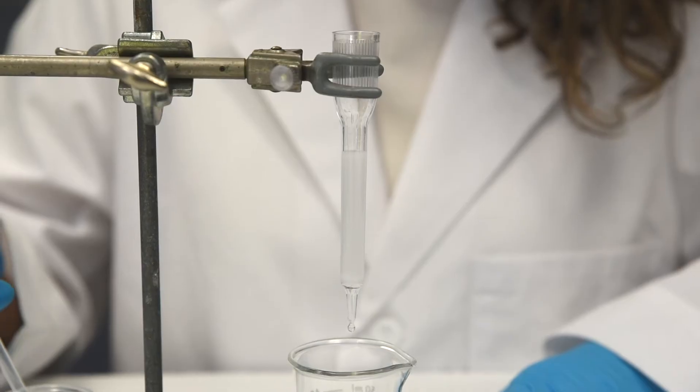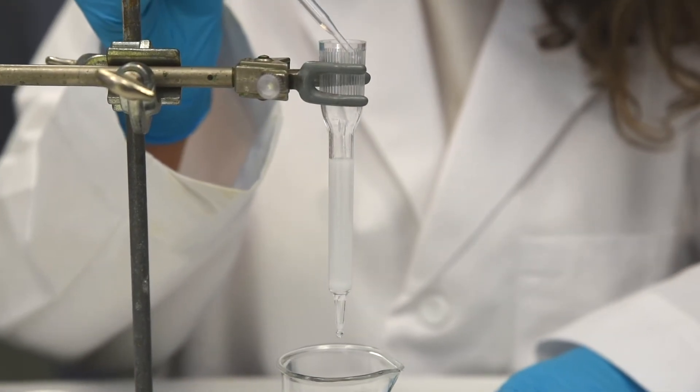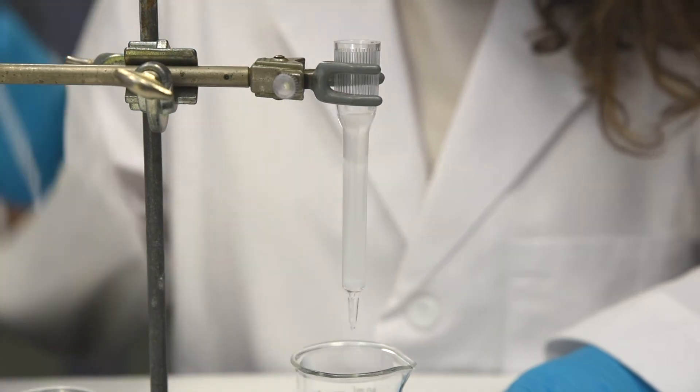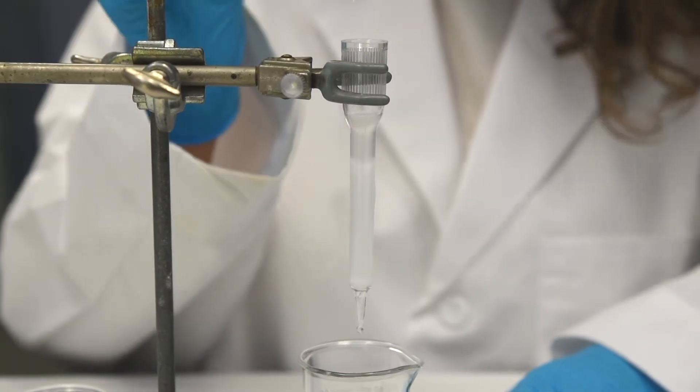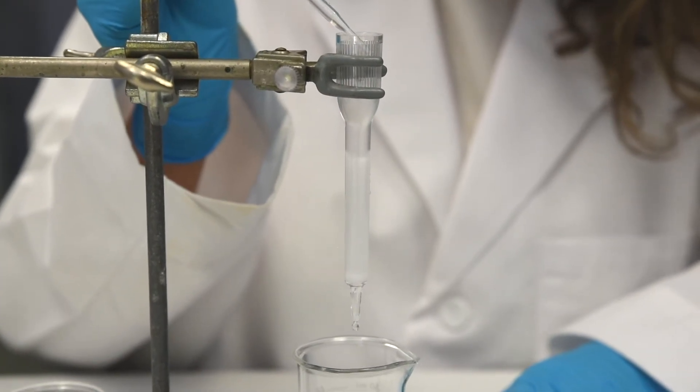Step 6: Wash the packed column with 5 ml of the 1x elution buffer. Always keep a thin layer of elution buffer on top of the packed matrix to prevent drying.